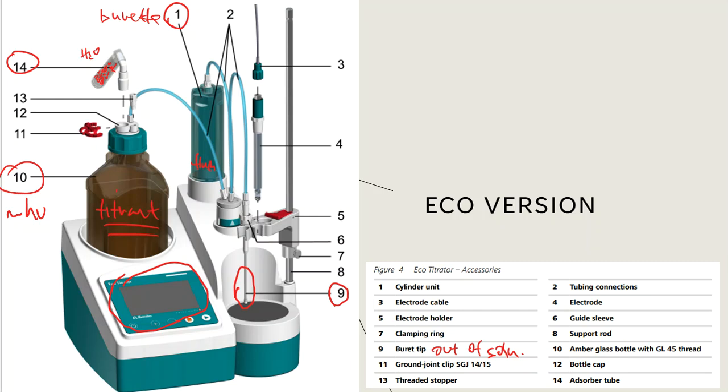Next up, number 4 is our pH probe. That's exactly what we're going to be using here in our lab procedure. But this doesn't have to be a pH probe. It can be another probe, another ion-specific electrode. It could work or behave in a different way. We don't necessarily do acid-base every single time when we use these. But we're going to. But I'm not limited to that.